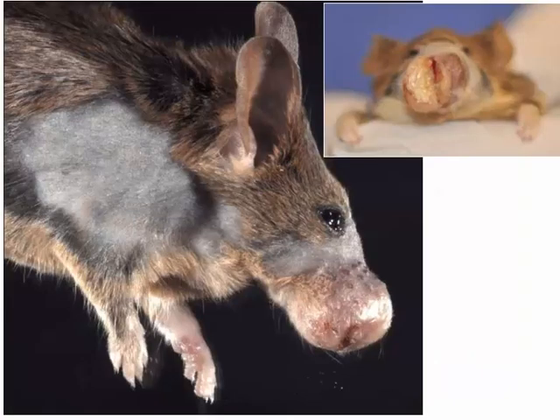Here's a couple of great pictures of a large nodular mass within the dermis of a mouse. Here's another mouse, similar location, and you can see that the mass is firm on cut section. It cuts very easily. The morphologic diagnosis would be pyogranulomatous perinasal dermatitis. This is a very common location for a cutaneous infection that's mediated primarily by Staphylococcus aureus, rarely by Pseudomonas, and the name of the condition in mice is botryomycosis.